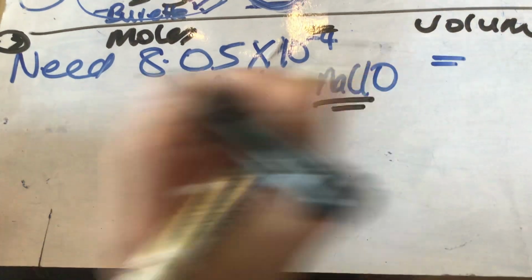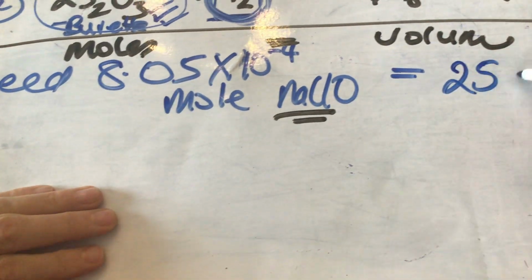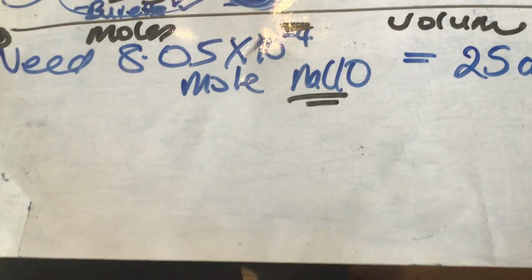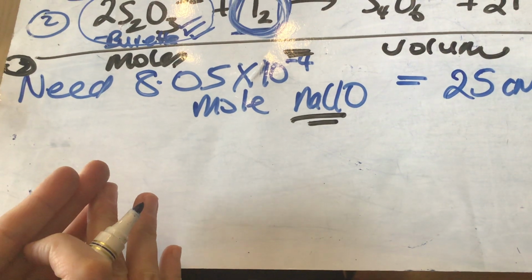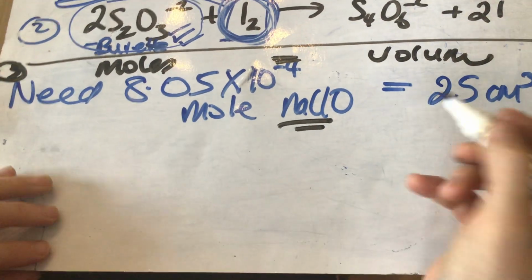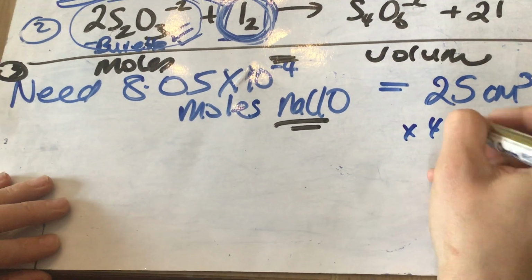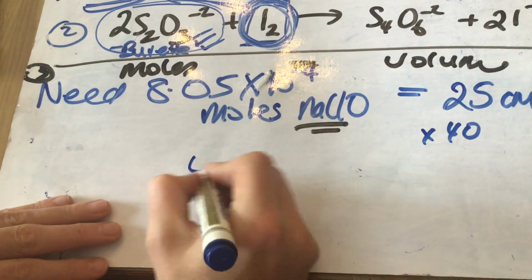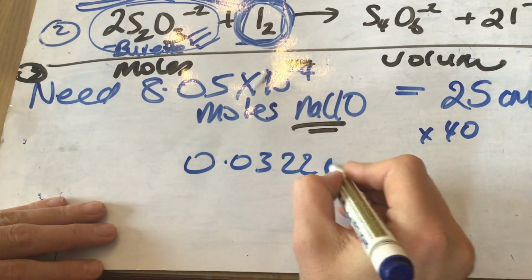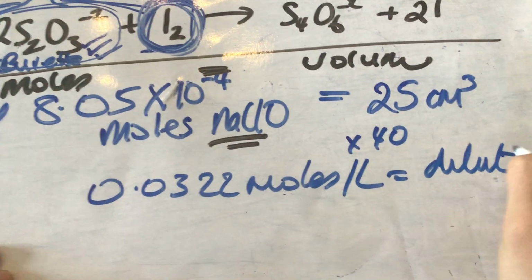Now, the hypochlorite is in the bleach, okay? And you pipetted in 25 cubic centimetres of that diluted bleach into the conical flask when you were preparing the iodine in the first place. So what would you have in moles per litre? That's moles in 25 cubic centimetres. So you multiply by 40, or else divide by 25, multiply by 1,000, and you get the molarity of the diluted bleach, lads. That's diluted bleach in moles per litre.